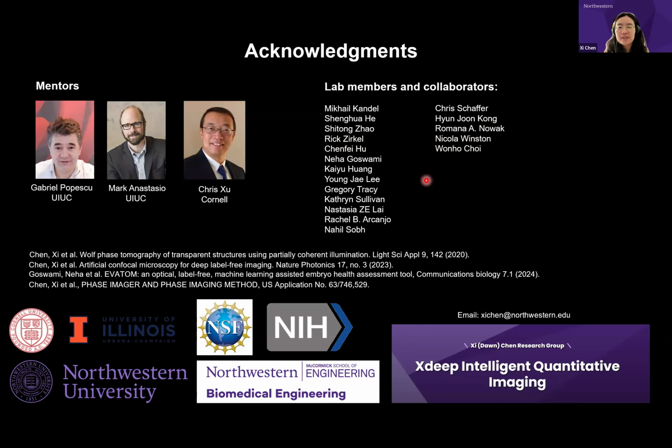We have just shown that this works, but of course, the reason we developed those imaging techniques is for imaging organoids over time. Using this, we'll be able to image live organoids and also give you the computational specificity and axial resolution that you needed. So I think we should be able to see the differentiation of the cells, and we should talk. You should reach out to me by email.